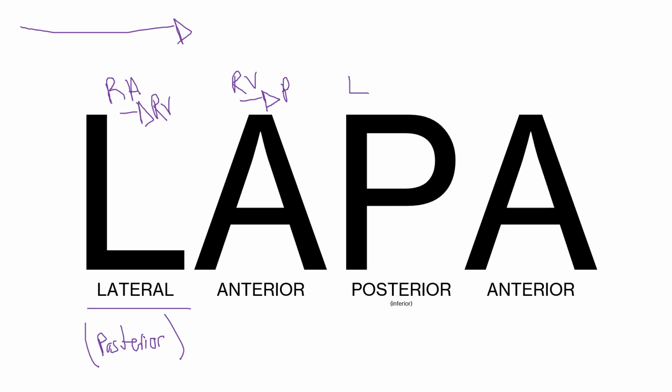So then the next cut, when our left atrium is opened, is from the left atrium to the left ventricle, again following flow of blood, approaching from the posterior aspect. And our last cut is back onto that anterior surface. We go from the left ventricle and distribute to the rest of the body via the aorta, our nice oxygenated blood.